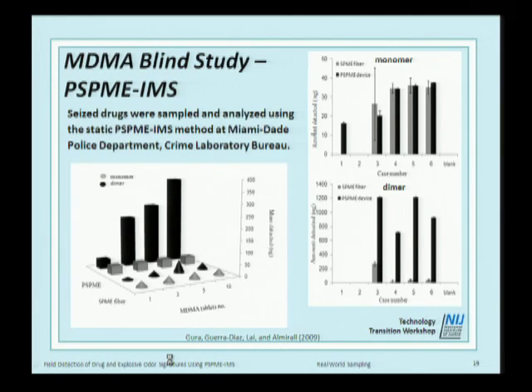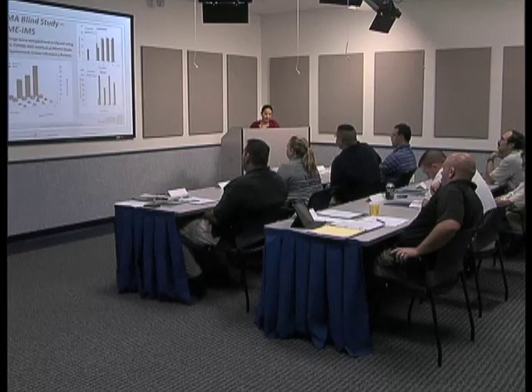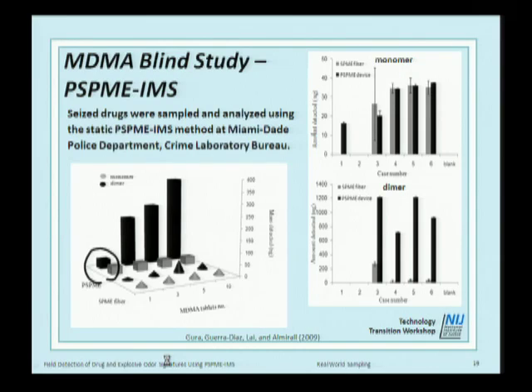Now we performed studies on MDMA tablets at the Miami-Dade Crime Laboratory using the planar solid phase microextraction device that we've been using in this workshop. And they were actually sampled and analyzed at their facility using an Itemiser 2 instrument with the PSPME device. So here we see that for even 1 tablet, we get a huge signal for the PSPME device, upwards of 40 nanograms. But if you go higher, you'll see that the PSPME has so much ability to absorb your volatile chemical compounds that you're actually seeing a huge signal for this dimer.